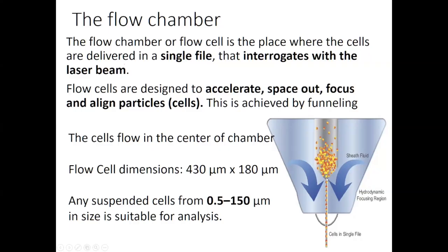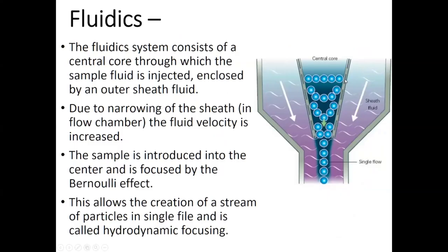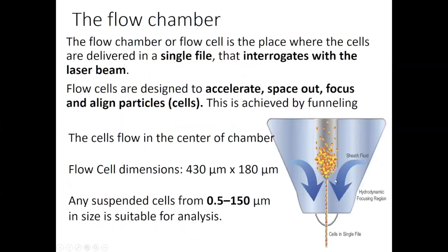Dr. Thulasi, we have a question on the chat box. Yes. Is the sheath fluid in contact with the cell line? Yes, it will be in contact with the cells. See, we have shown this partition to make things clear. But when it comes to this area, you can see they will be in contact with each other. The sheath and the cells will be in contact. It is not like it will be divided. Then how could the sheath put the cells in single file, right? It will be in contact, especially in this funneling area.